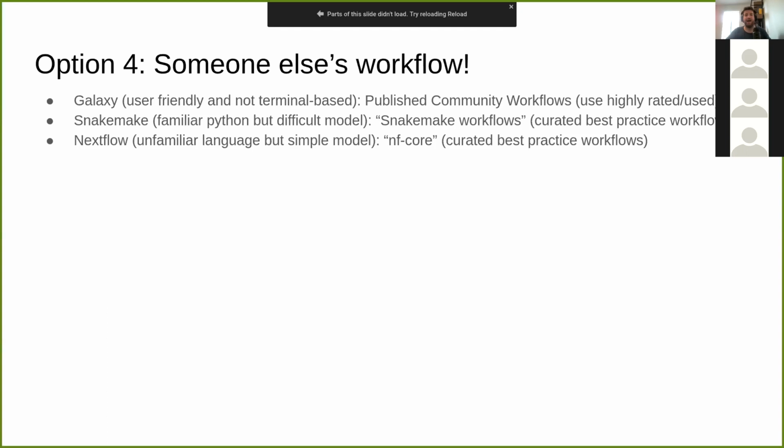Oh well. And option 4 is the best option, the one I actually recommend: using someone else's workflow. You can write these things yourself, but there's lots of people out there working on these workflows. There's lots of people using them, and there's lots of refining and dealing with all the problems. And there are some really nice high quality workflows out there.